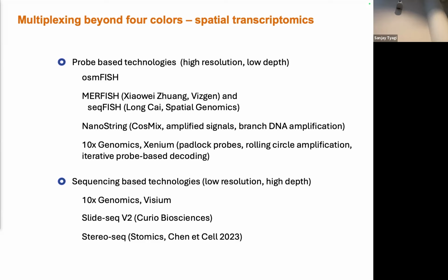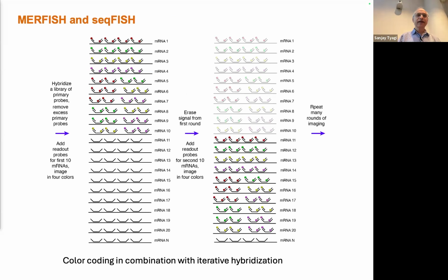Then there are the sequencing-based technologies, characterized by 10x Visium, Slide-seq version 2, and a very cool technology called Stereo-seq from China. They can do the entire transcriptome by single cell analysis. And I will have just a little bit to say about each of these categories.